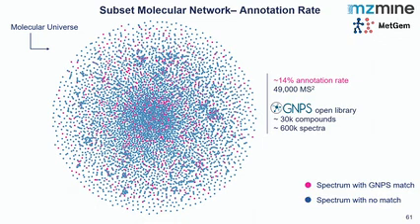And what we see here is that most nodes are still represented in blue, so only 14% got an annotation. So we see even if we buy just compound libraries, which is something you could just buy, right? I mean, it's expensive, but you should get the annotation for most of them because it's something you can just get from a supplier and then you can acquire the data.